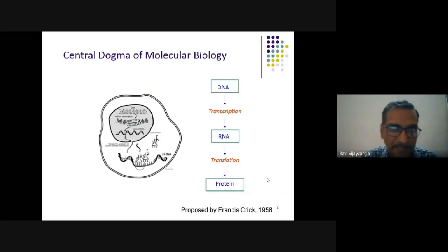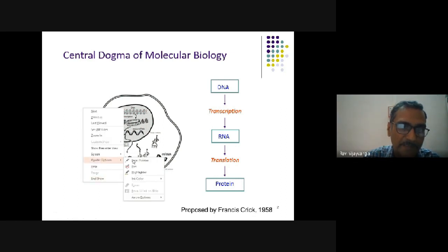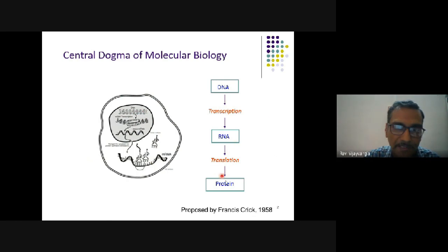So today, this is the central dogma. All of you are aware of the central dogma, that DNA upon transcription gives rise to RNA, and RNA upon translation, here especially the mRNA upon translation, gives you the protein. There are exceptions to it, but normally this is how it follows. So your mRNA will translate and give a protein, and this is what we are looking at. We have protein and we have to purify it.